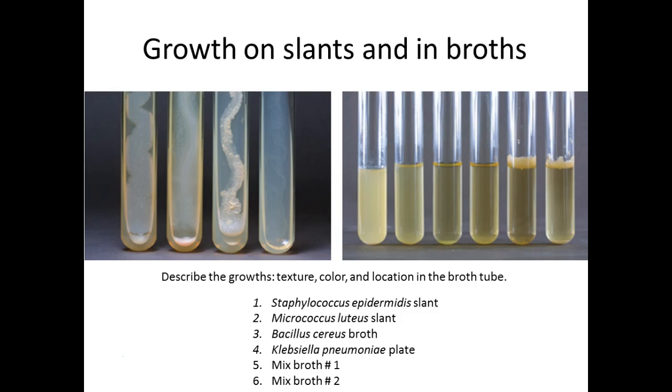And the research lab that I worked in, we had this wheel, almost like a Ferris wheel, in the incubator, and had little holes in it. We stuck the tubes in, and it spun them during incubation. But we don't have that, so we use mostly solid culture media in the tubes, again, to save space.